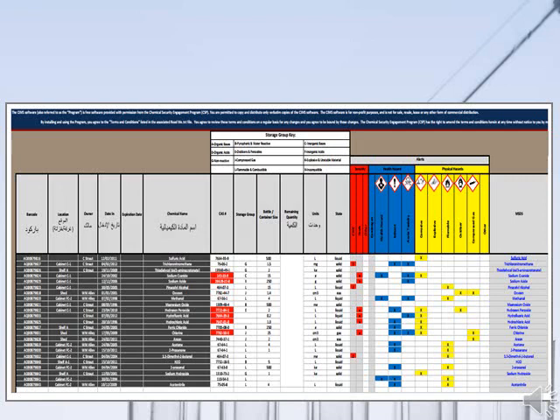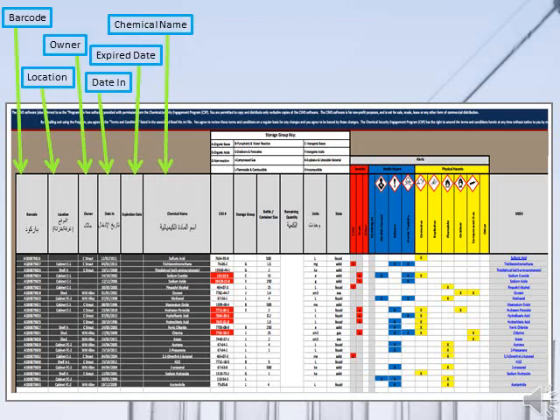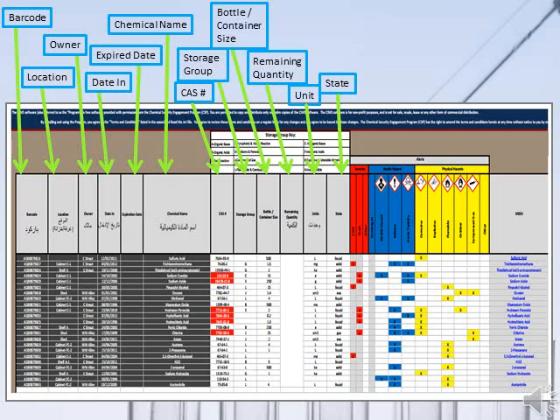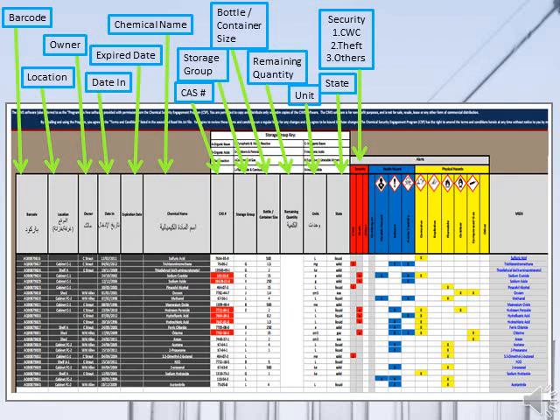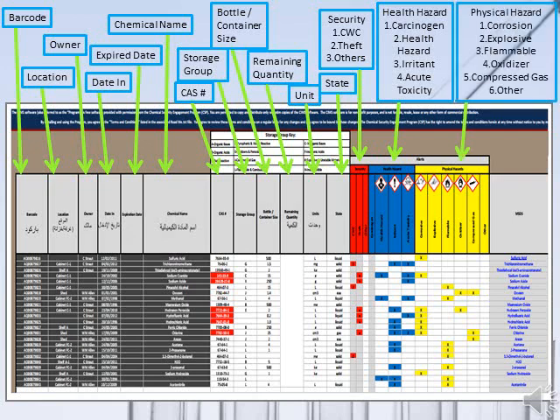The information needed in the master inventory includes: barcode, location, owner, date in, expiration date, chemical name, CAS number, storage group, bottle or container size, remaining quantity, unit, and state. There are three alert groups: the security group includes CWC, theft, and others; the health hazard group includes carcinogen, health hazard, irritant, and acute toxicity; and the physical hazard group includes corrosion, explosive, flammable, oxidizer, compressed gas, and other. The last column is for SDS location.